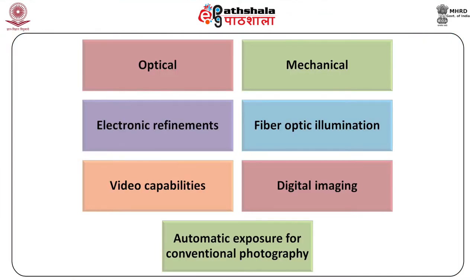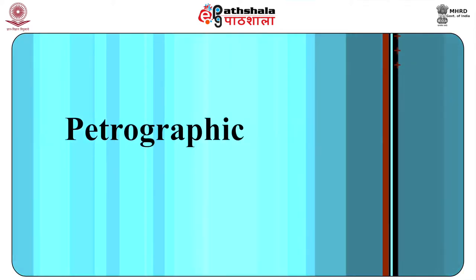The modern apparatus has various optical, mechanical and electronic refinements including fiber optics illumination, video capabilities, digital imaging, automatic exposure for conventional photography.